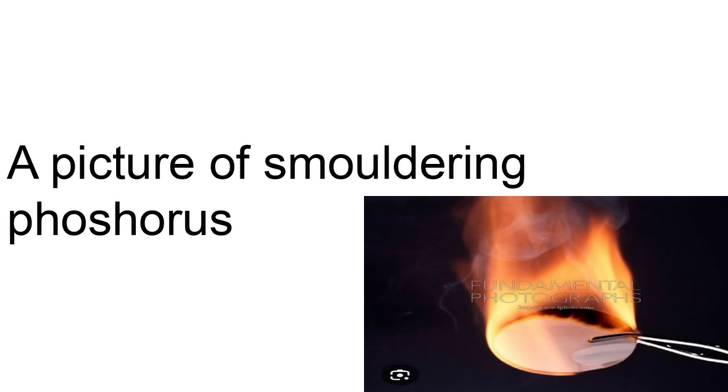Let us also note that phosphorus is suitable in this experiment because it does not react with water, number 1, and number 2, it smolders in air. Those are the 2 reasons why phosphorus is very suitable in this experiment.